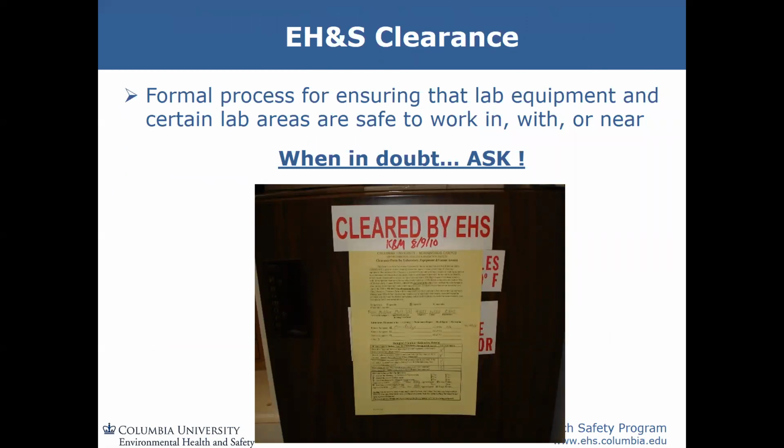Okay, so like I mentioned earlier, EH&S will assess the situation for laboratory clearance and determine if the lab needs to take any action to make the work area safe for you. For instance, if you need to work on a cup sink or an electrical outlet inside the fume hood, you should request a clearance from EH&S to make sure any hazardous chemicals are moved out of the way first. The clearance is not meant to be done anytime work in the laboratory is done, only when a real hazard to the work area is perceived to exist. But as always, when in doubt, just ask.